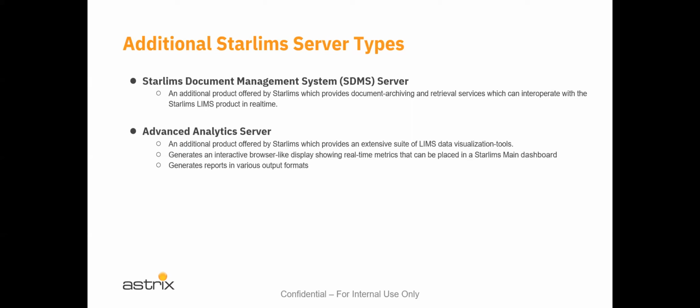We also have a new tool in STARLIMS called Advanced Analytics Server. It's been out a few years now. It is basically an offshoot of the Tableau server system, which is a third-party system available to be purchased by not just STARLIMS folks, but anyone else. They've got a very robust system that takes in data and creates real-time metrics and allows visualizations and bar charts and all sorts of different types of functionality.